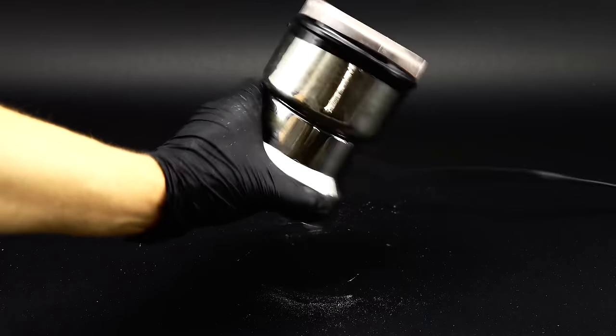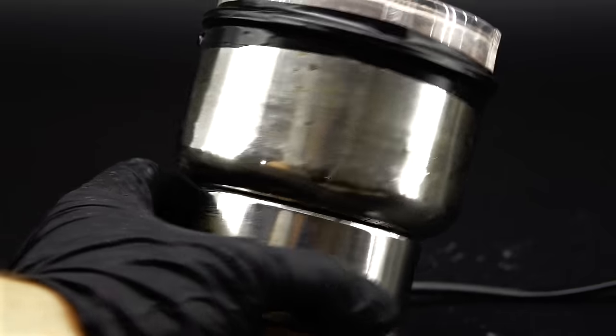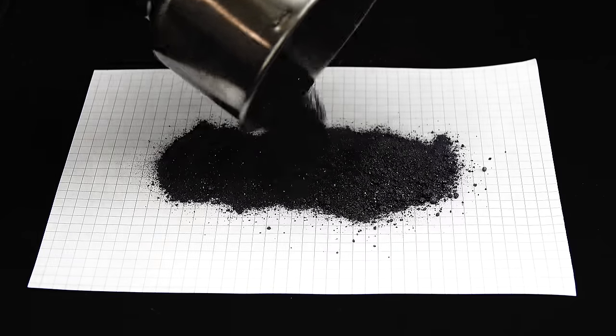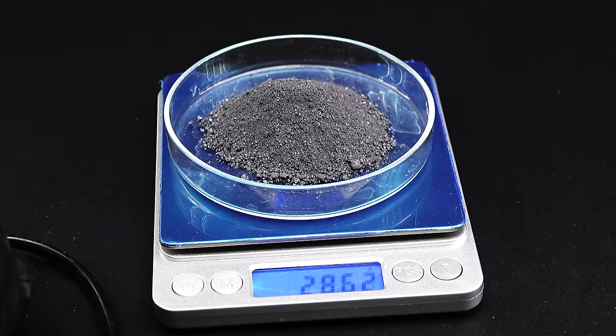This time I really committed to it and you can even see how hard the silicon smashed against the metal walls of the grinder. Anyway, the powder now looked much better and I weighed 28 grams of it to use for making the silicon tetrachloride.